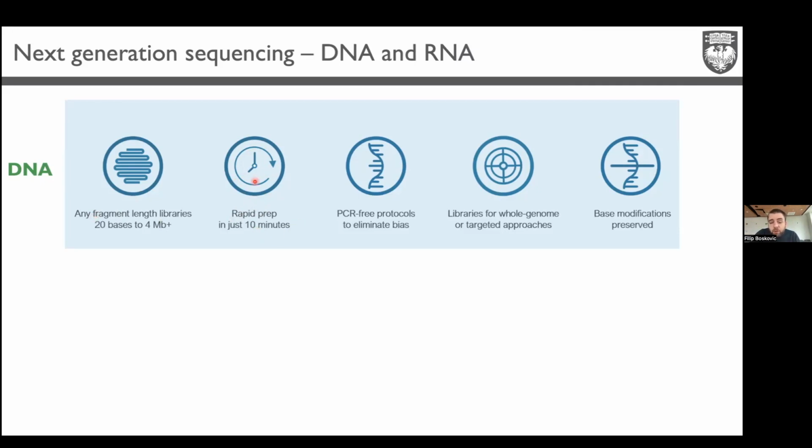There are enrichment protocols. If you are sequencing the human genome, of course, it's a massive genome, and you're interested only in a gene related to some rare disorder. For example, I was working with my colleagues on myotonic dystrophy type 1. Of course, you have only 2 copies of your gene in the whole cell. You don't want to sequence for 3 days. You want to sequence as fast as possible and see what the variant of that gene is. So there are protocols that enable very quick sequencing.